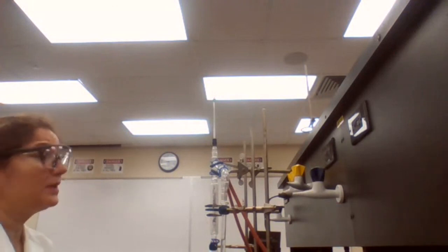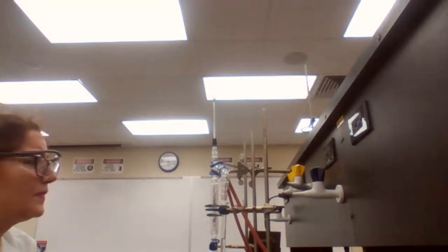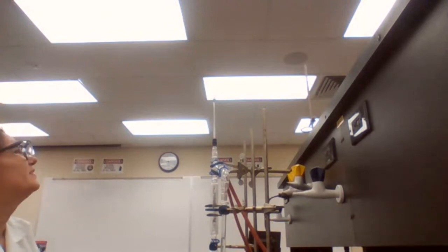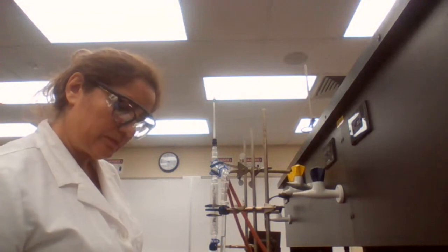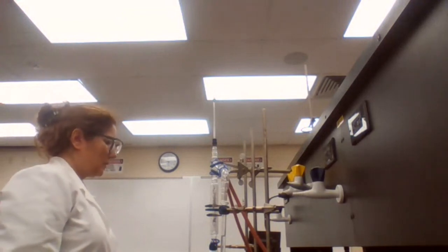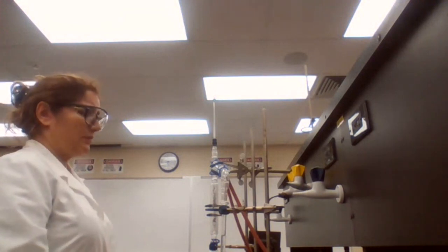So 15 milliliters is 93. And 16 is 94. I'm going to collect one more to see if we have a stable number here.